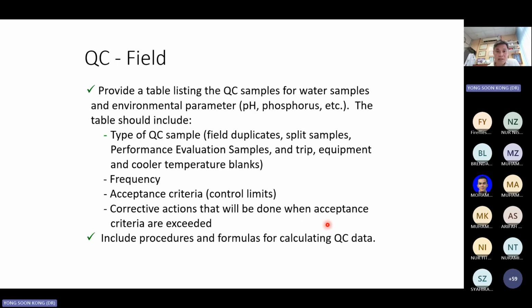Okay, so QC field. I think this one is more about the preparation that you do a day before your field trip, the day before. Water group, you have to prepare this, only when you feel it's necessary. So apart from collecting 60 sampling bottles in the plan, you also need to consider all these things.